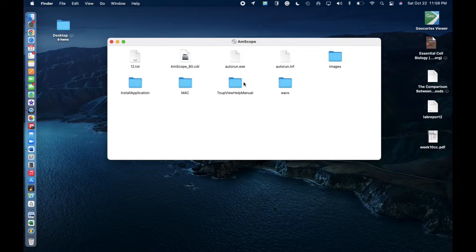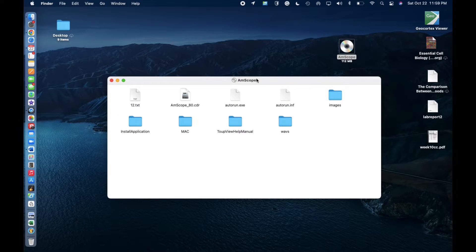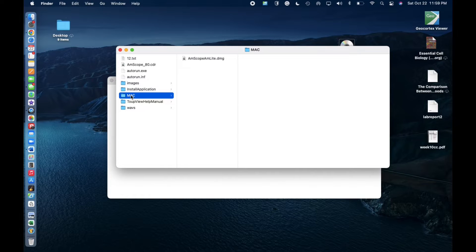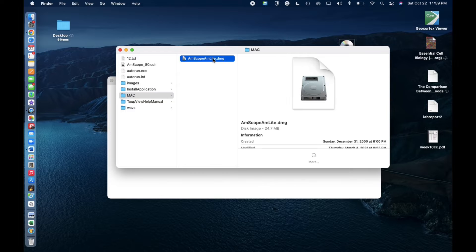So we have the Amscope disc inside. We're going to click on Mac and it's already selected Mac. So you're just going to click this right here. Double click it.